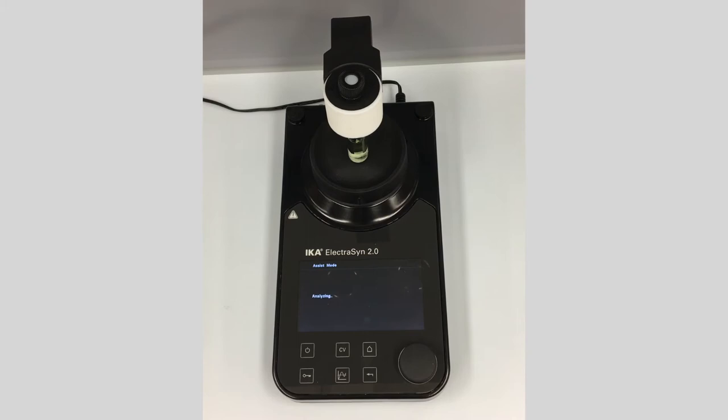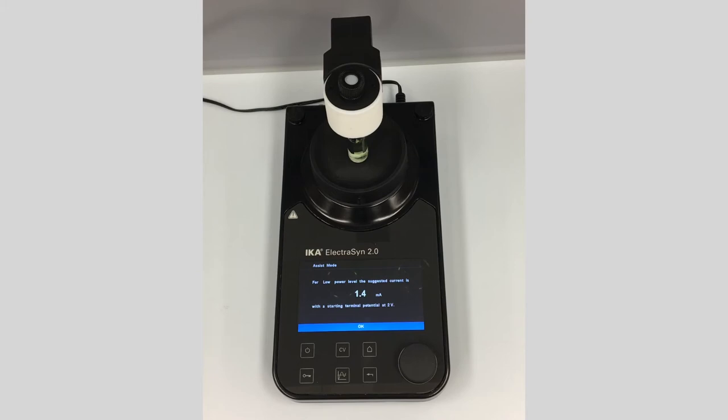The ElectroSyn analyzes the resistance, and from that it determines the starting potential. It's suggesting about 1.4 milliamps. Based on our knowledge of this reaction, I know it needs a little bit more, so I could go into the editing screen and adjust that.